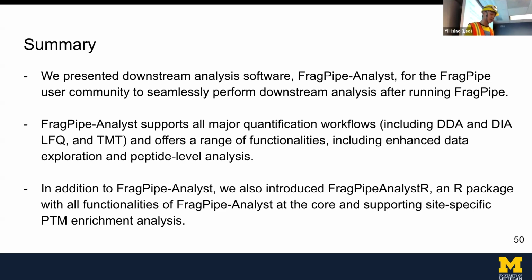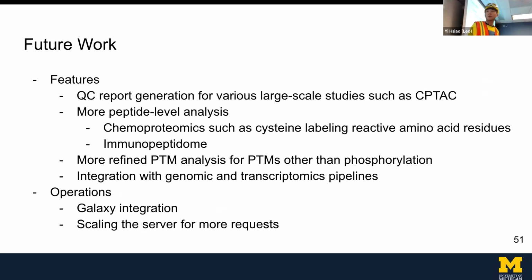And in addition to FragPipe-Analyst, I also developed a package called FragPipeAnalystR that could basically cover all of the functionality of FragPipe-Analyst and support site-specific PTM enrichment analysis. We are still actively working on it, but I think we are really getting there. And there is a lot of future work. For example, as a group, we also have a whole facility.